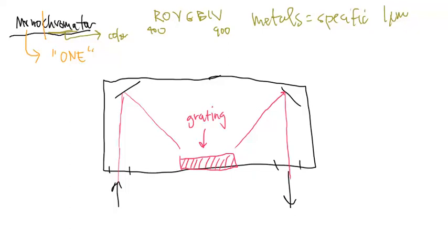And a grating is very similar to a prism. If you've ever seen a prism, when you shine sunlight into it, it takes that light and divides it up into its individual components that you can see with your eye. This is how rainbows happen in the sky, right? Red, orange, yellow, green, blue, indigo, violet.